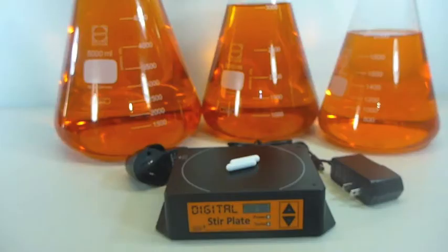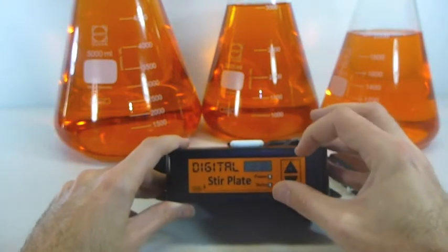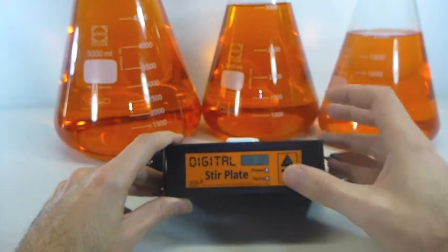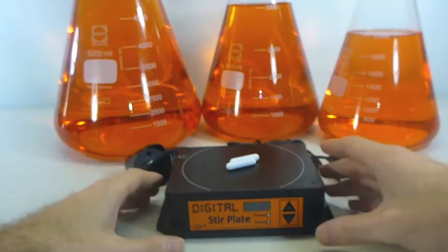The digital stir plate is different to traditional analog stir plates in that on an analog stir plate, you'll dial up a number on the knob on the front panel and it will spin at a speed that's roughly proportional to the number that you've selected on the dial, whereas the digital stir plate is different.